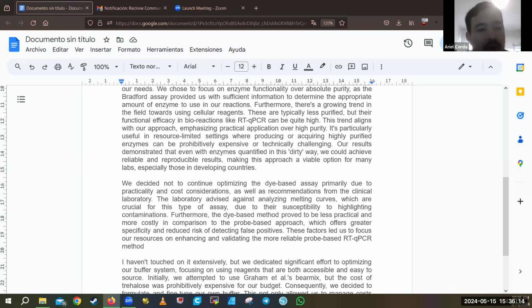Oh, thank you. We have very good results with enzyme stability using trehalose in our buffers. But for our kind of setup, trehalose was very expensive, so we preferred not to use it. But we know that with trehalose we can leave the enzymes at room temperature, and we have no problem with that. Oh, I've read about it, but also found it expensive. Thank you. Thank you.